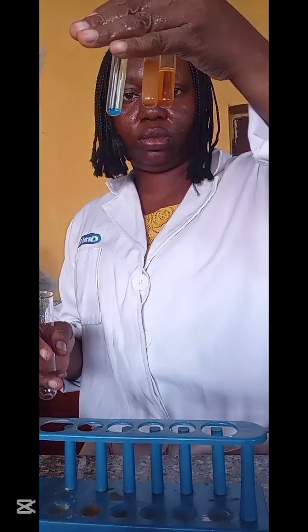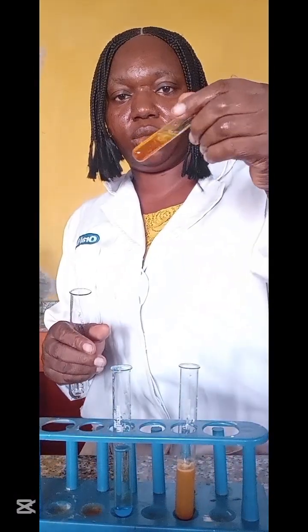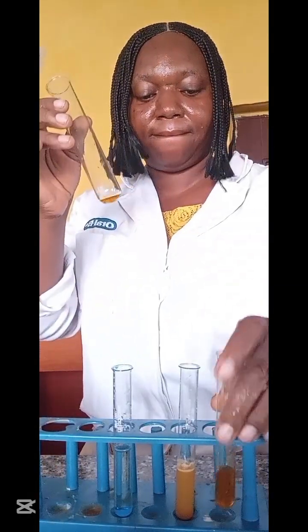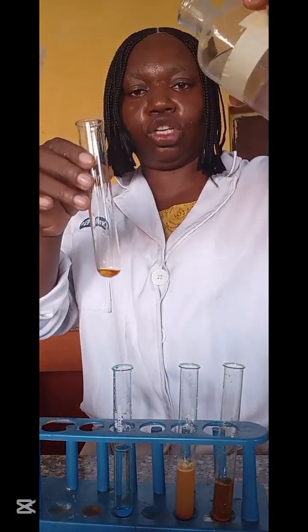So now, these are the transition metal salts. Let's test them. Let's go with this first. Sodium hydroxide.